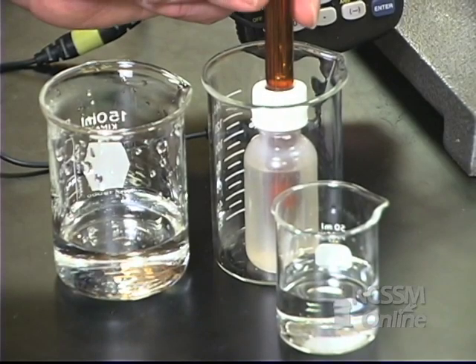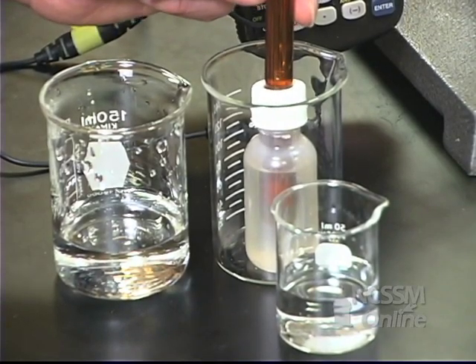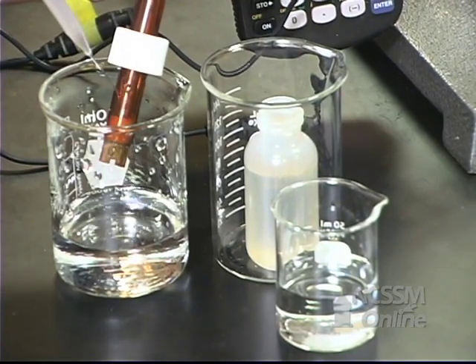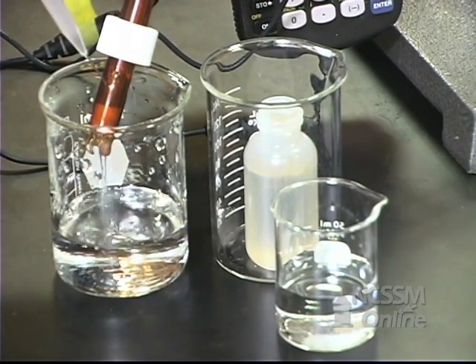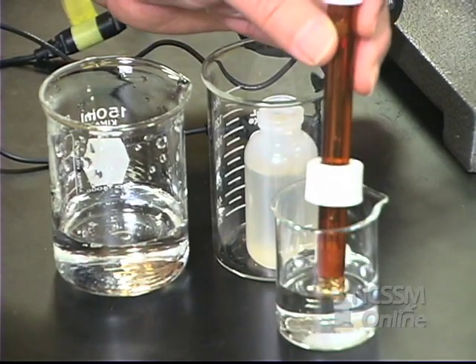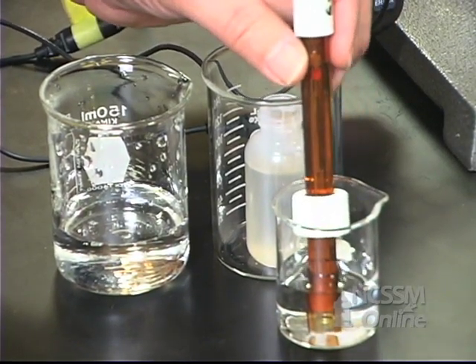We're now going to read the pH of the calcium hydroxide solution. I'm going to take the pH probe out of the storage solution, rinse it with some distilled water, and place it into a saturated solution of calcium hydroxide.